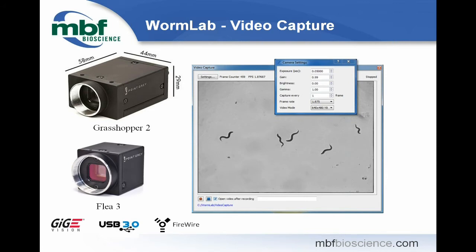The cameras that we're showing you on the left, these are the cameras that we support today. They're Point Grey cameras. These are high-quality CCD, which is charge-coupled device, monochrome cameras. They work beautifully for capturing worms. The interfaces that are supported are FireWire, both A and B, USB 3.0, and sort of the new standard, which is GigE Vision. That's a 1 gigabit Ethernet connection to the camera.